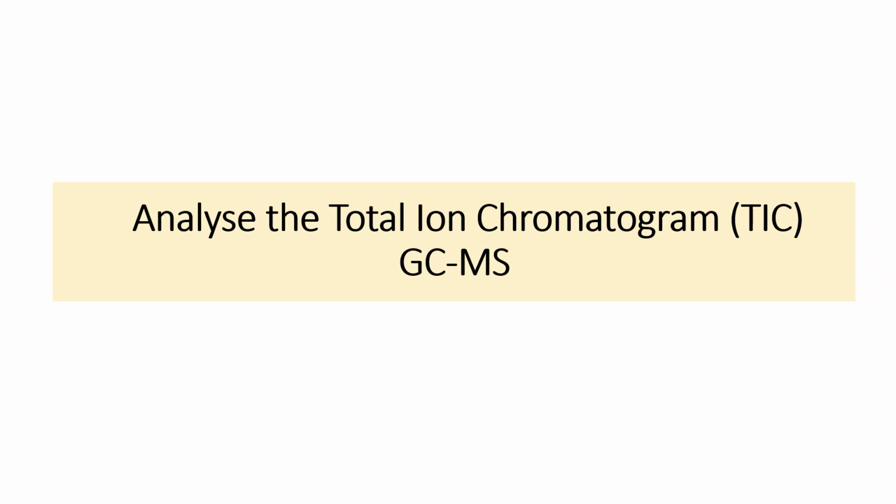Welcome everyone. Today we will analyze the total ion chromatogram, which is a critical, data-rich tool that summarizes the entire MS scan to allow for the identification and quantification of the compound. So we will learn how to analyze the TIC, or the total ion chromatogram, using GCMS.